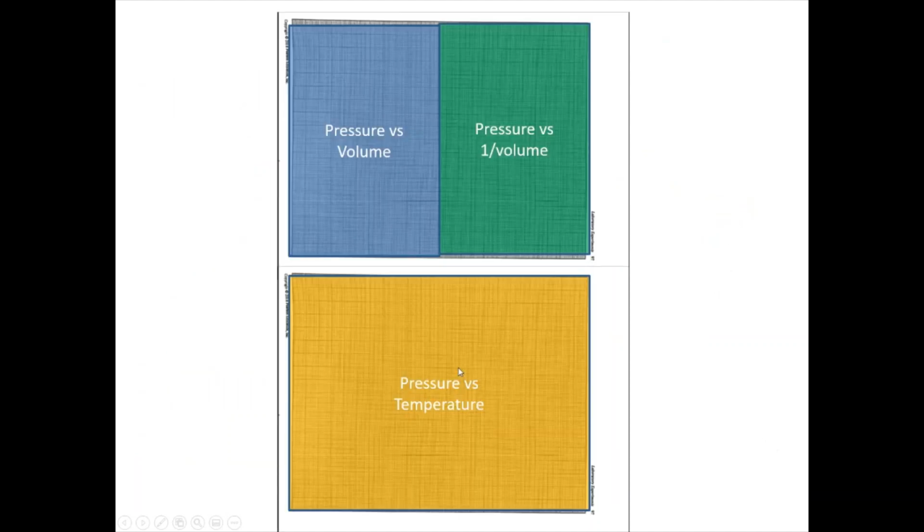So just to show you with the graph paper, in your lab book, there are 2 sheets of graph paper that go along with this experiment. Here's what we're recommending that you do. On 1 sheet of graph paper in the book, you can create your pressure versus volume and your pressure versus 1 over volume graph. You can choose how you want to do it. You can do them as portrait, as I show here, or you can have it graphed the long way, however you want, whatever is going to make it work the best. But basically split 1 page in half for those 2.